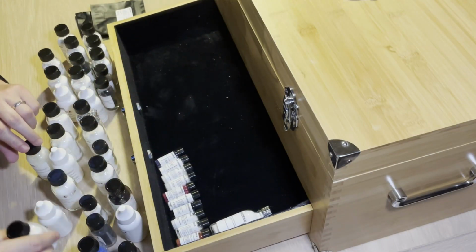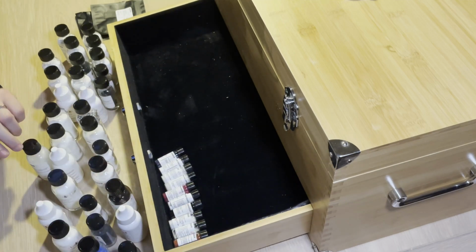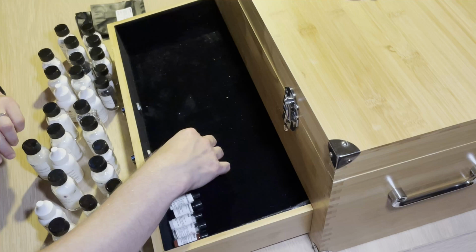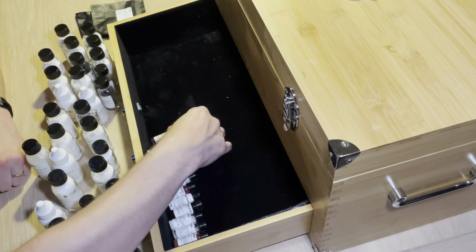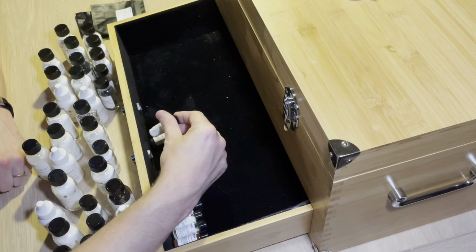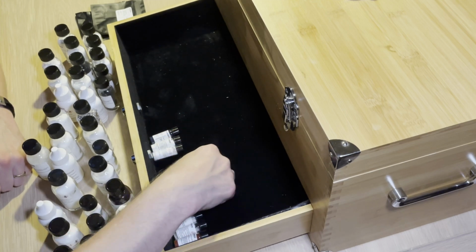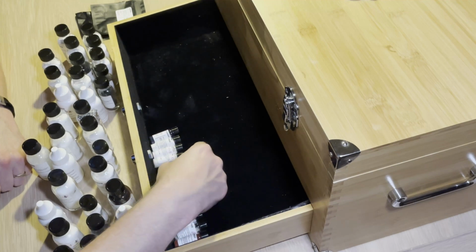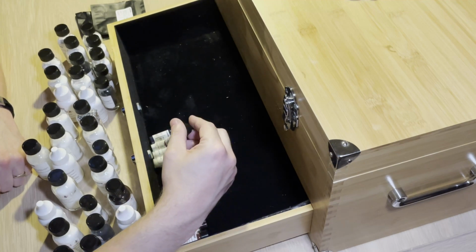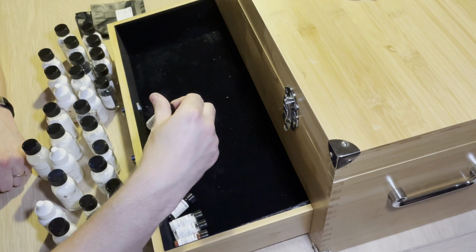And we have potassium chloride. And then there is a bunch of small ones here, which I'm going to leave in here. Indigo carmine, lithium chloride, tin 2 chloride, strontium chloride, cobalt chloride, don't put it in the beer, potassium iodide, ferrofluid.